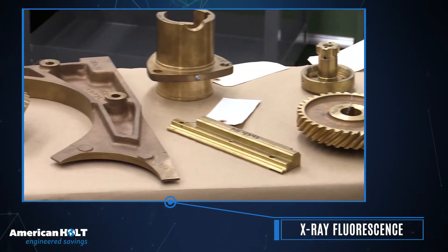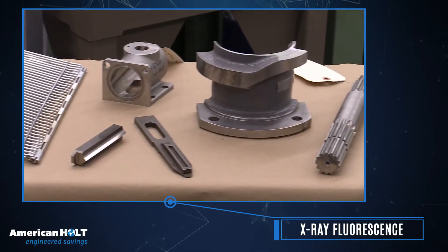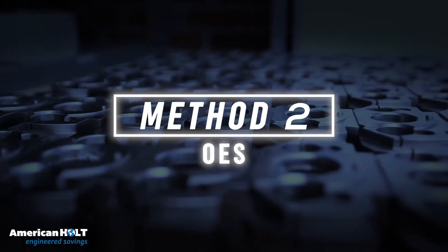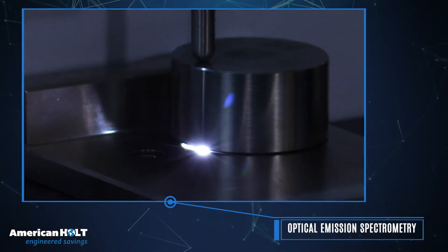The metallic components we test are most commonly copper alloys and alloy steels. However, the XRF cannot detect light elements, such as carbon. For materials with lighter elements, like carbon steels, we employ our optical emission spectroscopy system.